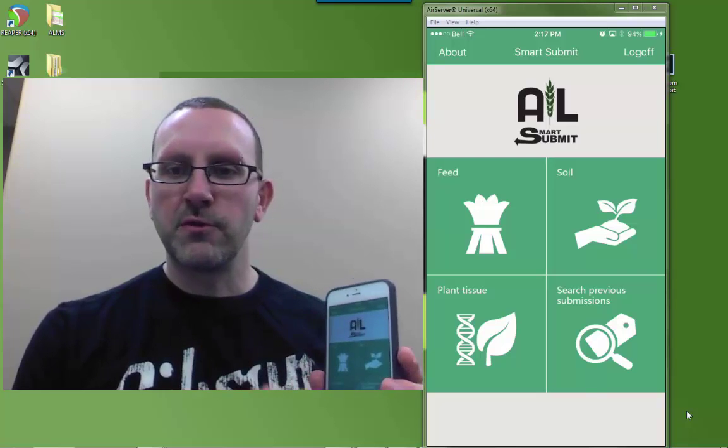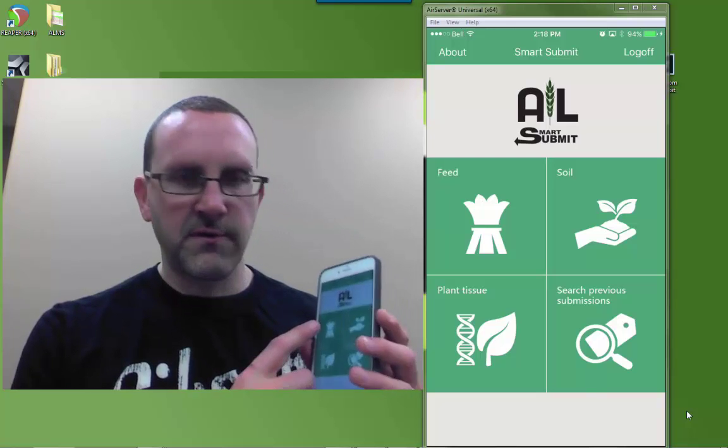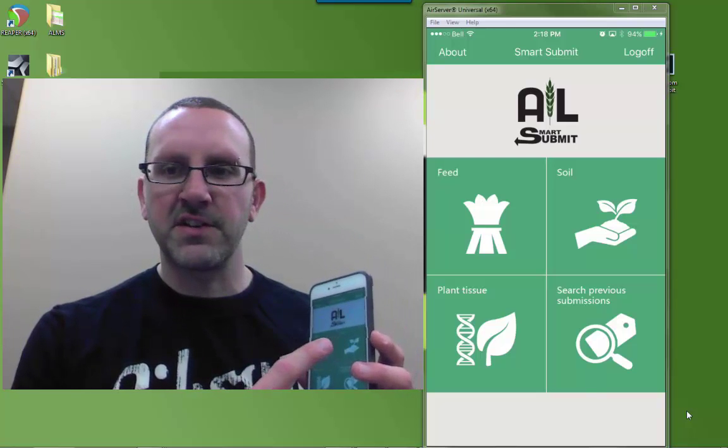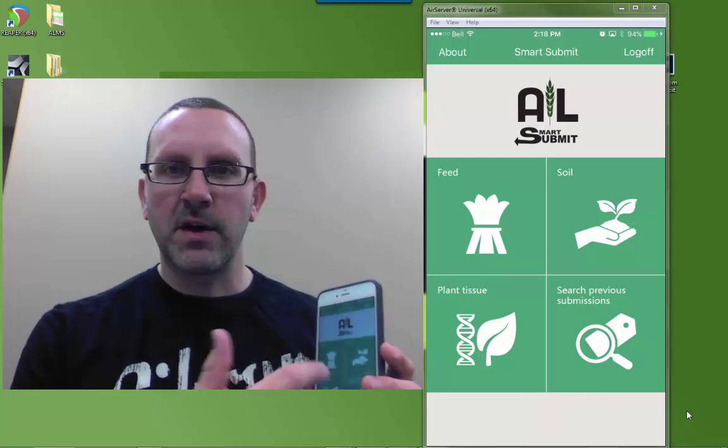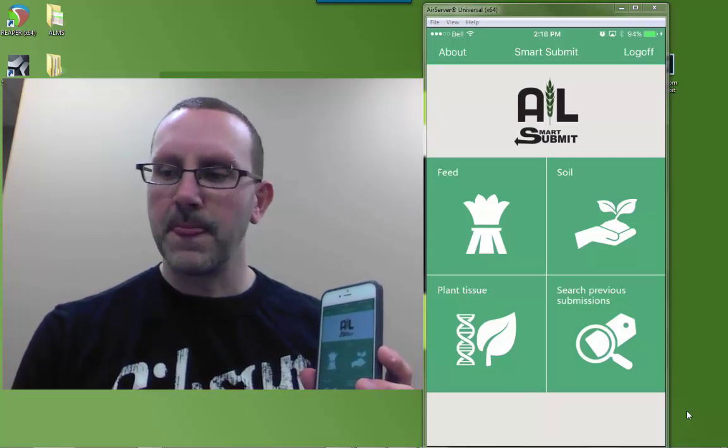It's got some new functionality, plant tissue, feed analysis, and some other functionality to the soil module.